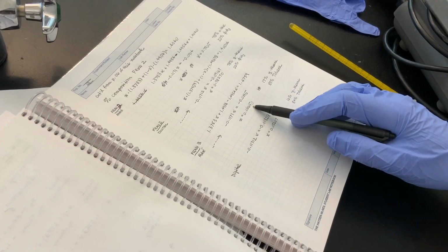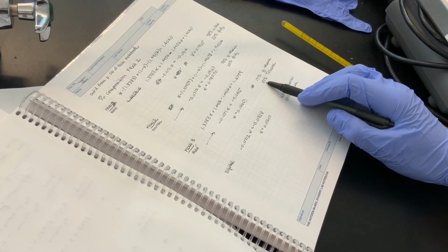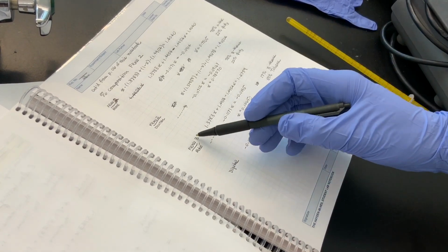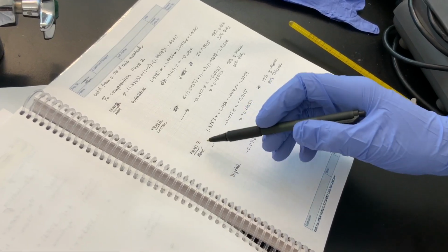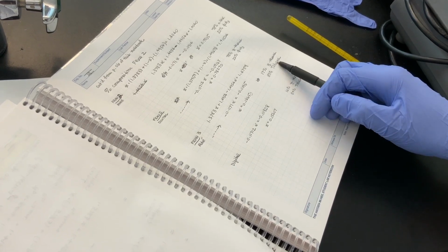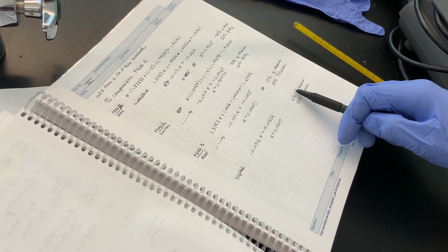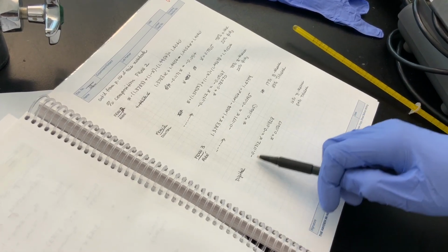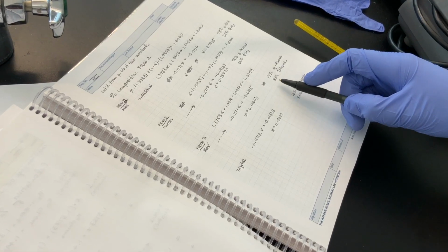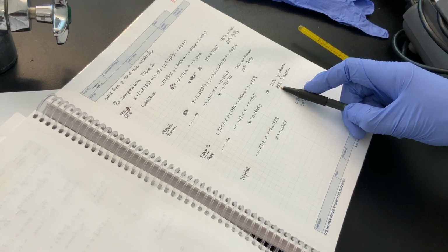Anyway, rounding this up and multiplying by 100, that gives 17% hexane and 83% toluene. And that's what we wanted to see. We were aiming for separation such that fraction 3 should be mostly the higher boiling solvent, toluene. So the distillation wasn't perfect, of course. We can see that in these data. Something similar was read out for the digital one. But nonetheless, the majority of fraction number 3 was the higher boiling toluene, 83% composition.